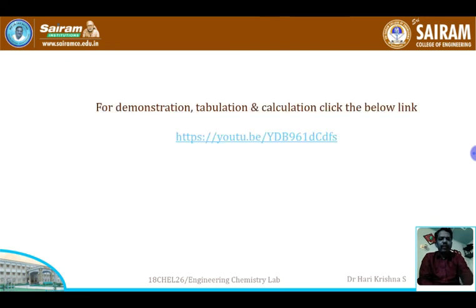Okay, so for demonstration, tabulation and calculation of the total hardness, estimation of total hardness of given water sample, please click the below link. Here the preparation of standard solution and titration are shown, and the values are also tabulated to get the concordant values, and the entire calculation till the ppm of calcium carbonate is done. So please click the below link for demonstration of this experiment.